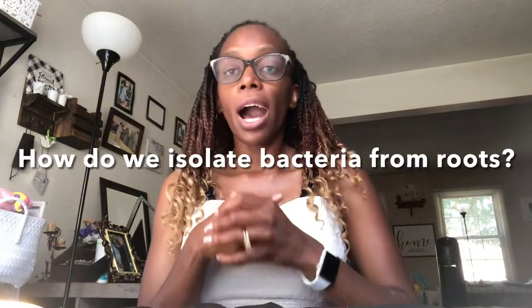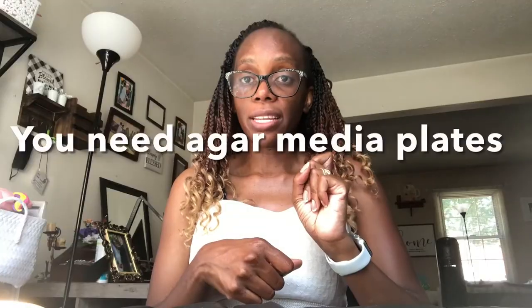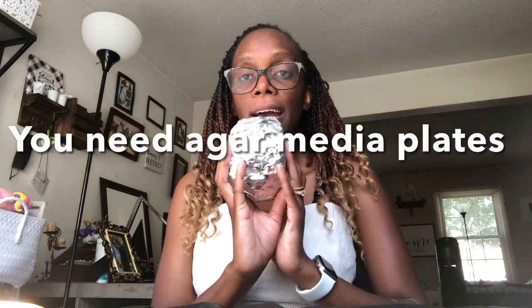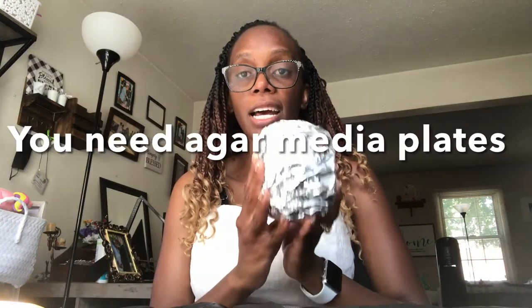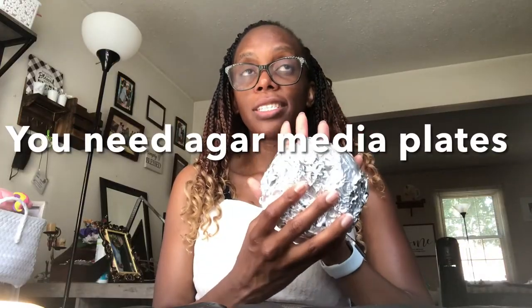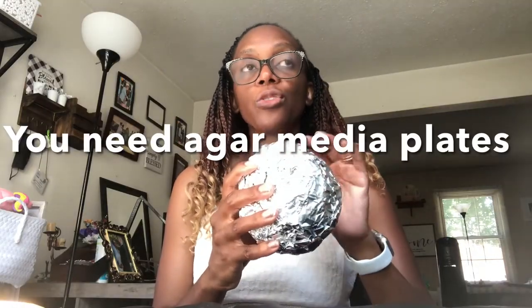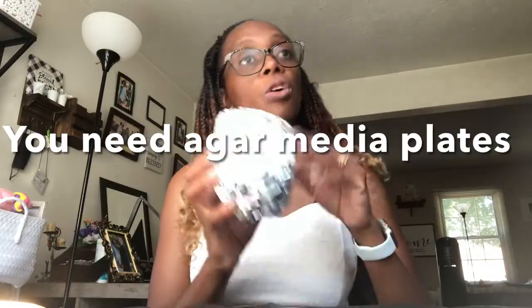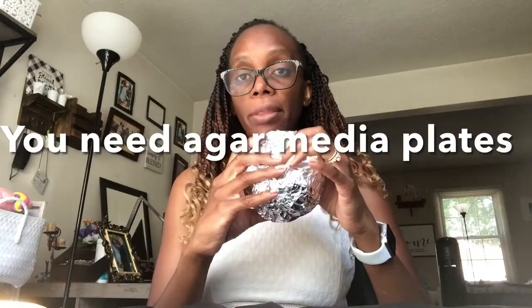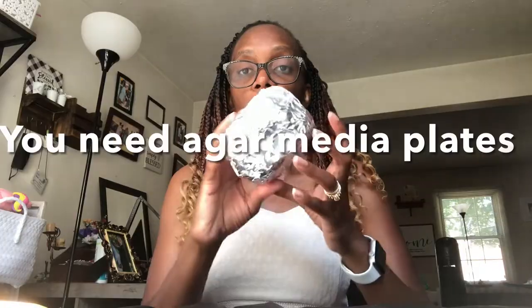Okay, so how do we isolate bacteria from our roots? What do you need? First of all, you're going to need agar plates that have media. Media is essentially a jelly that has different chemicals that are perfect nutrients for bacteria, or fungi, or microorganisms in general to grow. There are different types of media, which we'll talk about in the next class. So you have this particular one. Remember, you kept this in the refrigerator, so you need to take that out.